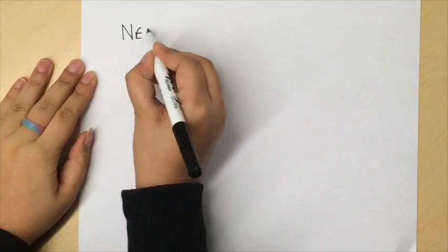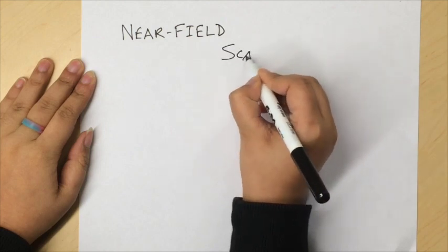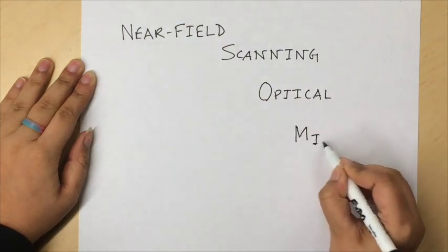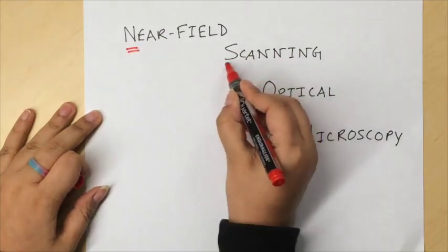Hi, I'm Shudeshna. I'm going to talk about near-field scanning optical microscopy, in short, NSOM. But before I start, I'd just like to put a little disclaimer here that my drawing is really bad. So please bear with me for the next couple of minutes.